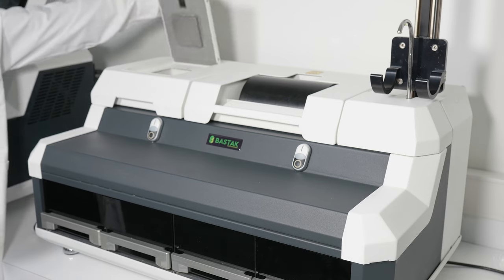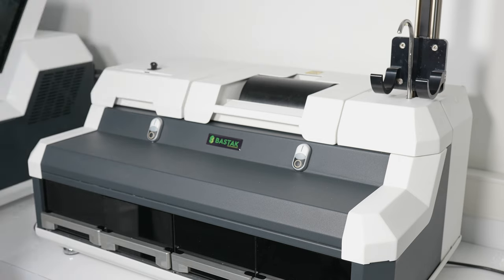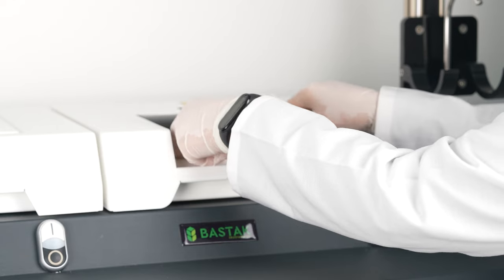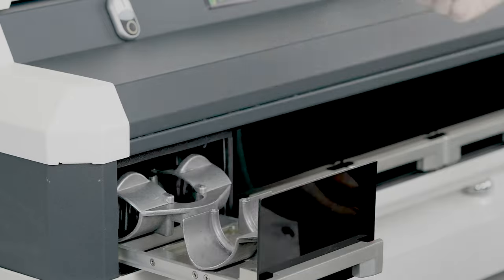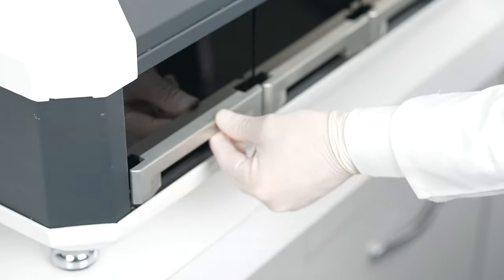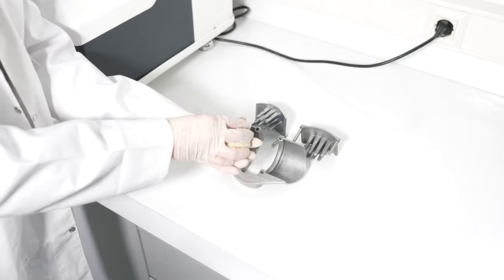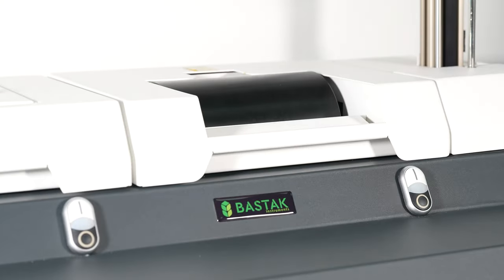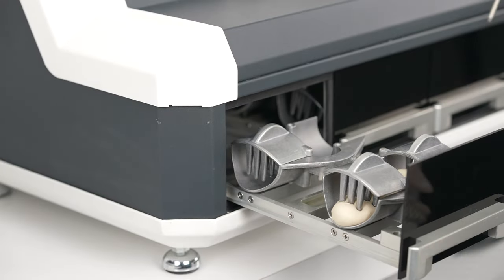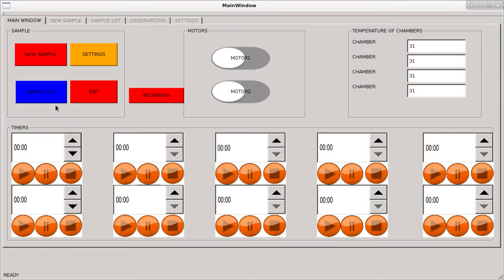For the third 45 minutes of fermentation, the dough samples are placed in the dough rolling unit and then in the dough cylindering unit for shaping. This process is repeated for the parallel sample, and the dough samples are returned to the fermentation room. The stopwatch is set to 45 minutes to monitor the fermentation process for the third interval.